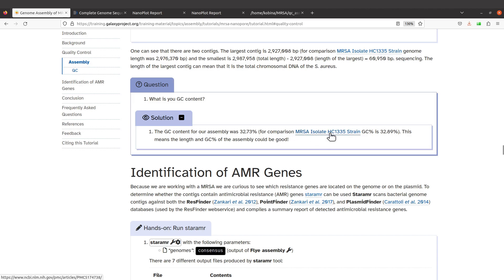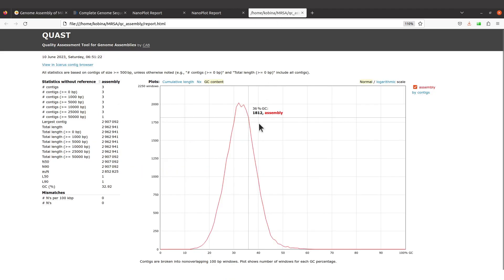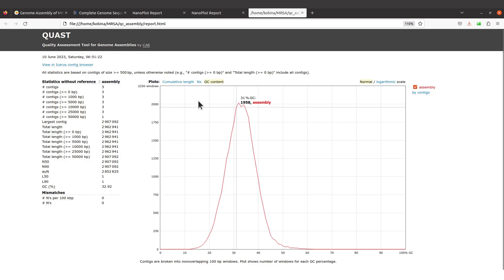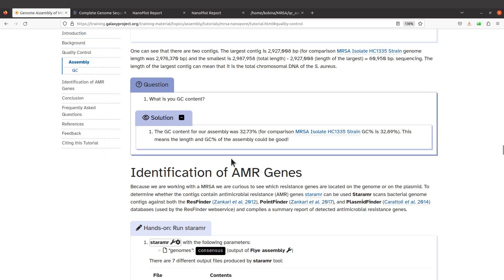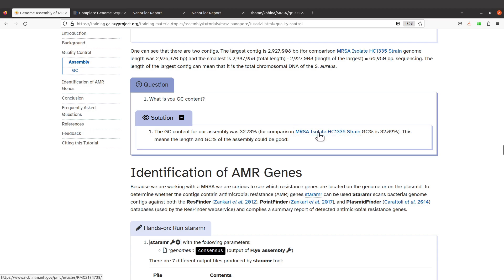With the MRSA isolate, GC content is 32.89 percent. Ours is 32.92 percent which is slightly above. They are almost the same, the difference is not that much. And so this also means that the length and the GC content of assembly is good because the values are close to the MRSA which is being used as the reference sequence.